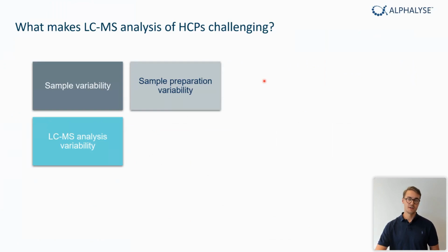So is the system you're running this on stable? Are you sure that it's running optimally? Because it's very, very sensitive instruments, so many things can go wrong, and it's also why it's very important to monitor these things.